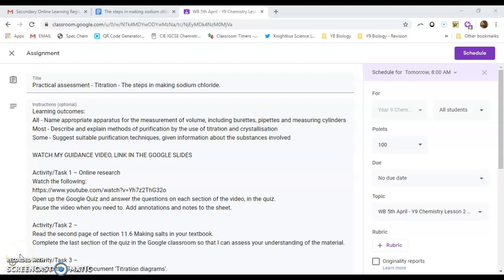Hello and welcome. This is a guidance video for Year 9's Lesson 2 that I have organised for you for week 4 in chemistry. This is a lesson that's a little bit practical based, and it's based on a practical that you need to be studying, which is a practical technique called titration.